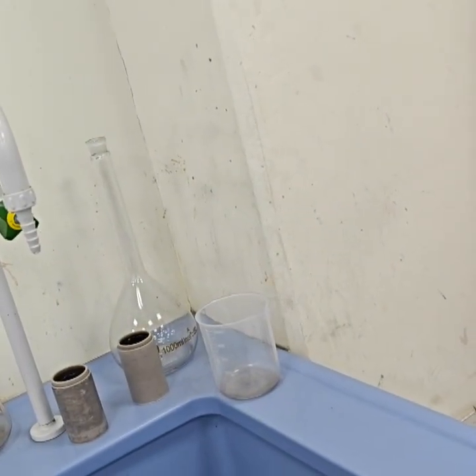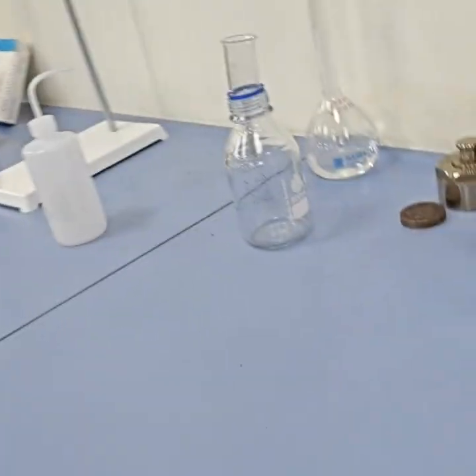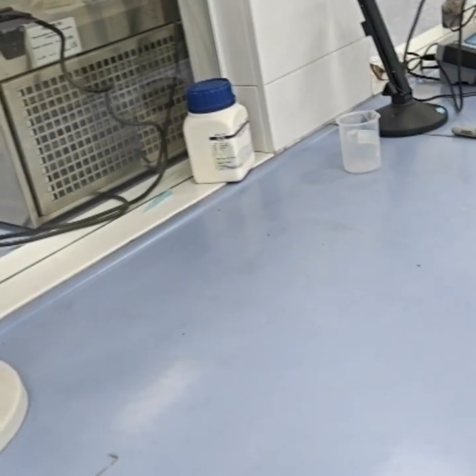Also, there should be no food or drink in the laboratory. And for example, if you are working with chloride or any kind of salt, you must adhere to the material safety data sheet, or safety data sheet.